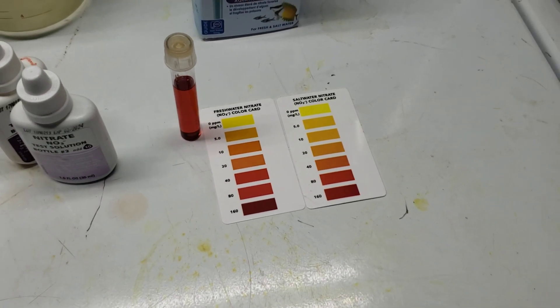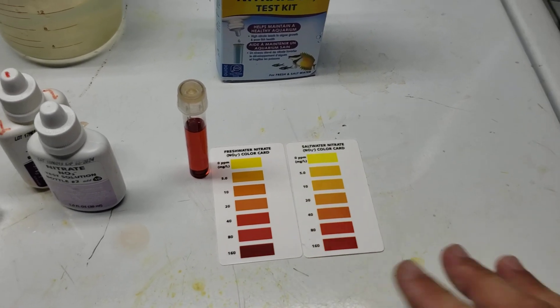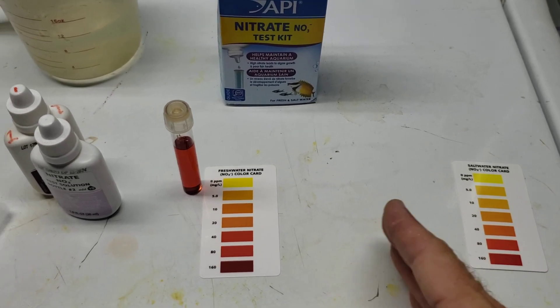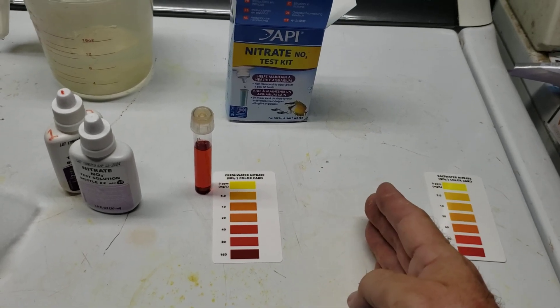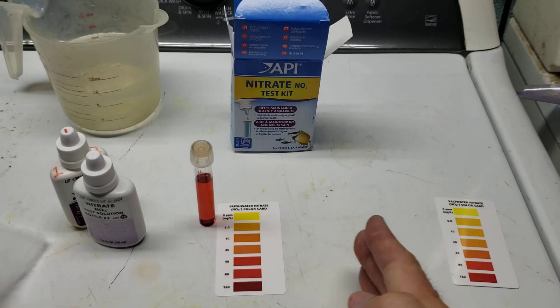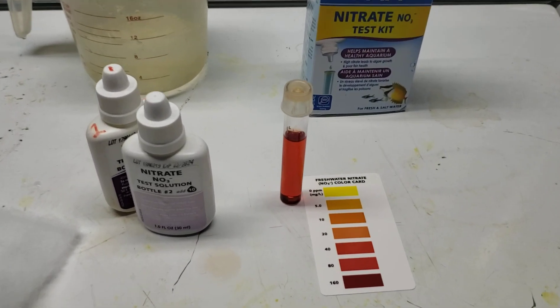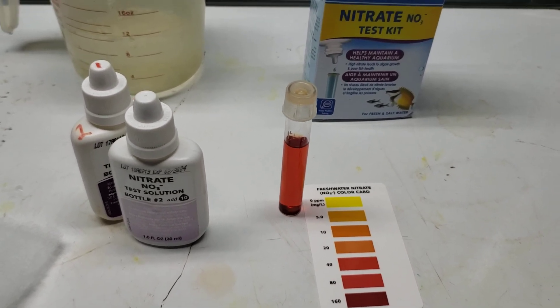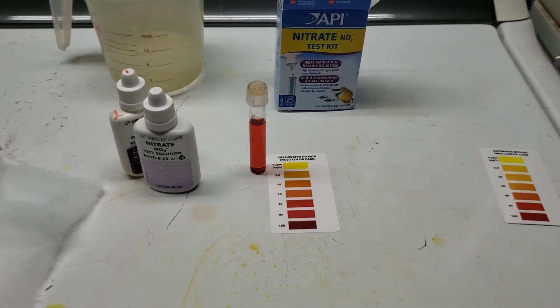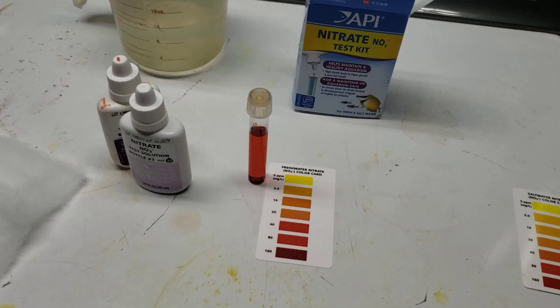If there's a color difference between saltwater and freshwater, what makes the color different? Where is the gradient or the threshold between this color, and then suddenly you get enough salt in the tank and it's this color? If you've got a brackish tank, how much salinity is in there is going to change that color to some degree. Without knowing an awful lot about what's going on in a tank, and without having some kind of spectrometer that would give you the exact color — and in fact, the light bulb you're looking at this test under is going to change how red or brown or orange it looks — all of that taken into consideration should be proof positive that these nitrate tests from API were never meant to be super precise.